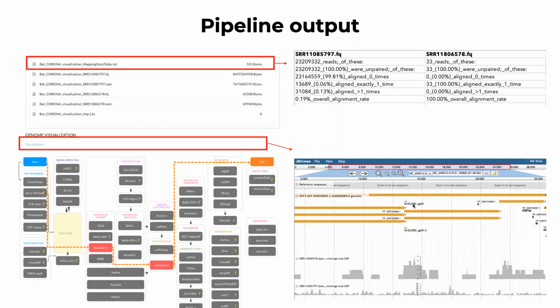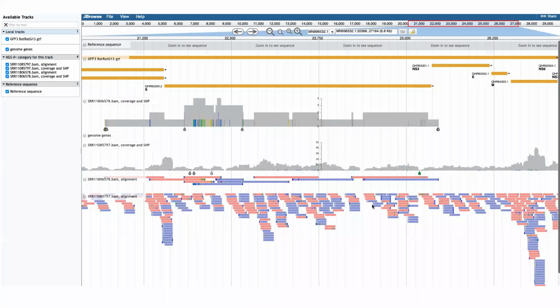We'll give you some ability to practice and start looking for specific positions that you think are different from the reference genome. I will, again, on the forum, share with you the files and the directions to follow. If you have any questions, please review this video. Or if you're not getting the results that I am getting and showing you in this session, then you can put those on the forum as well. We'll make sure to address those and check your pipelines individually.